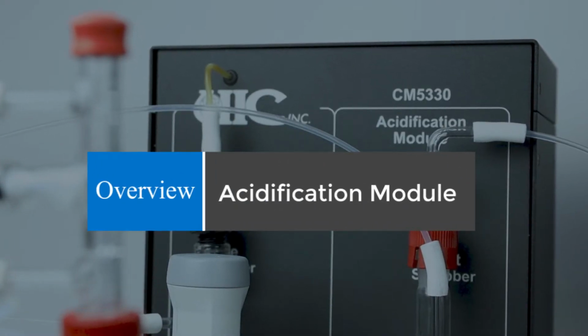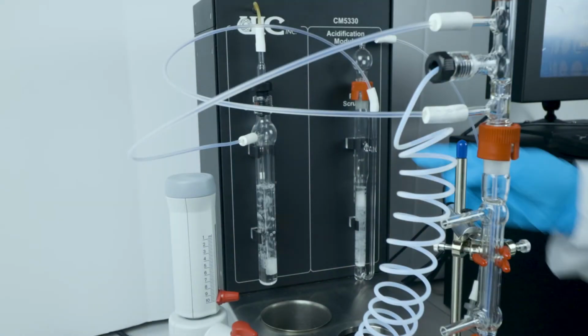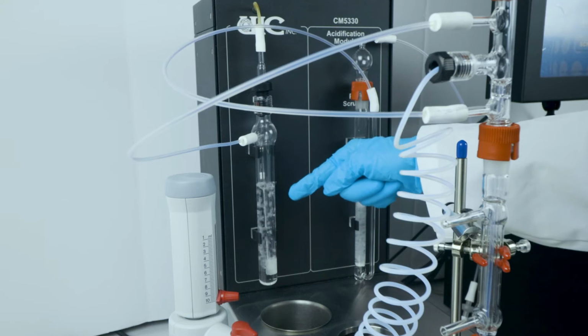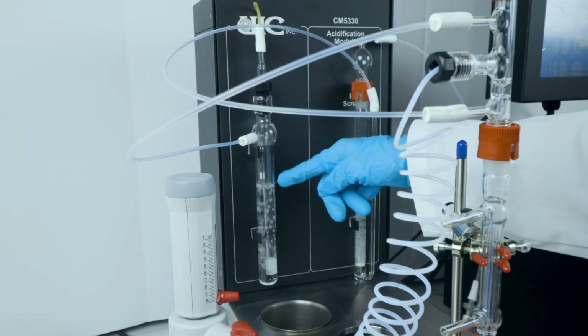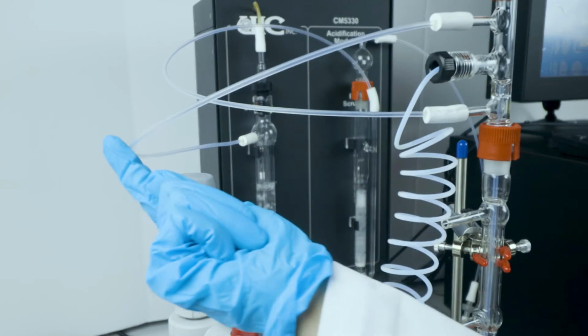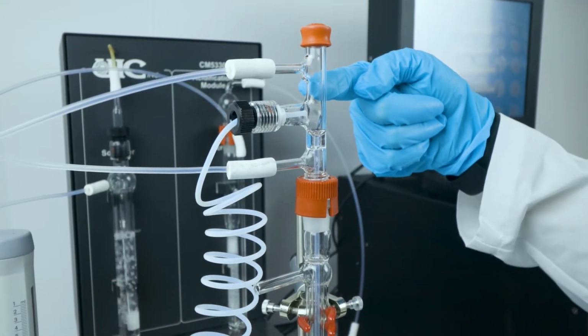Next, we'll be providing an overview of our CM5330 acidification unit. First, we have the pre-scrubber with KOH solution where the carrier gas will flow into. Notice the level in which the tube will need to be filled. The carrier gas then flows through the Teflon tubing into the upper finger of the 3-finger adapter, down the condenser, and into the sample tube.